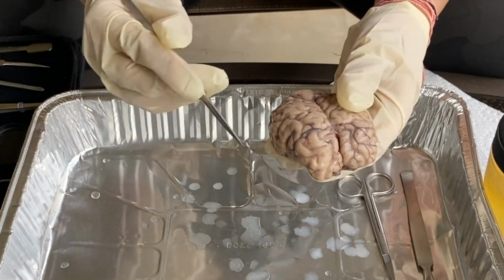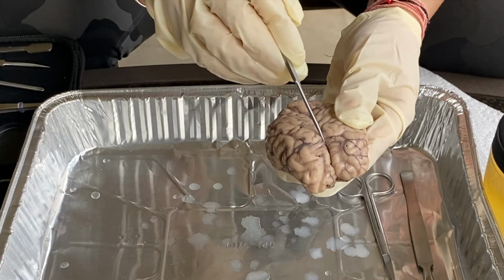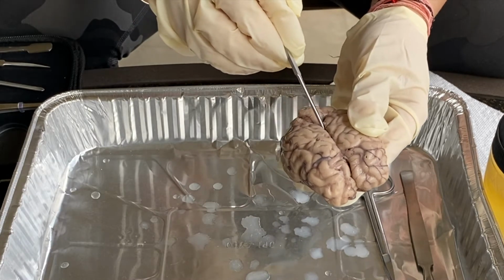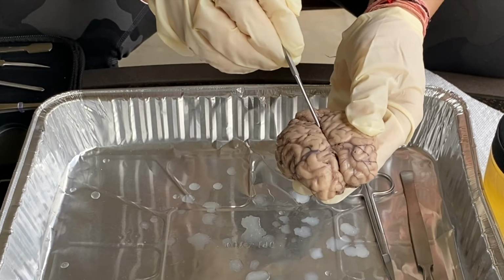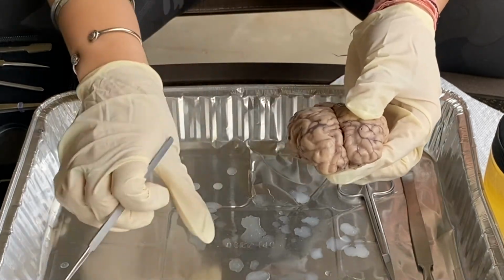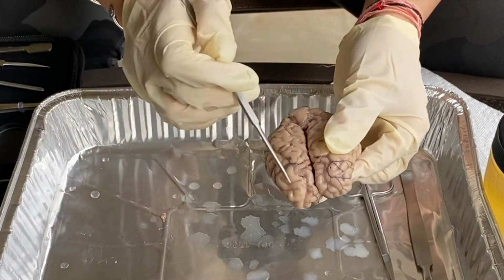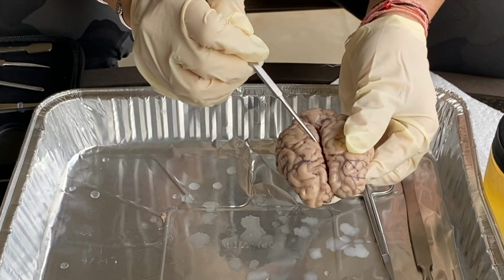So down the middle here, we have our medial longitudinal fissure. So I'm just gonna dissect the pia mater right here real quick. And this is the largest fissure of the brain, and it separates the 2 hemispheres from each other.